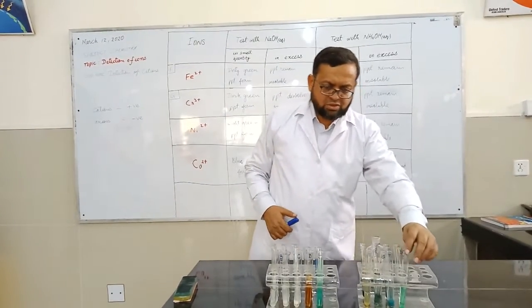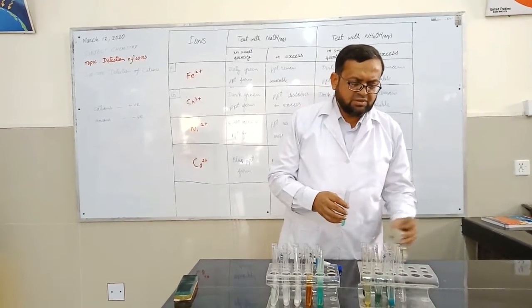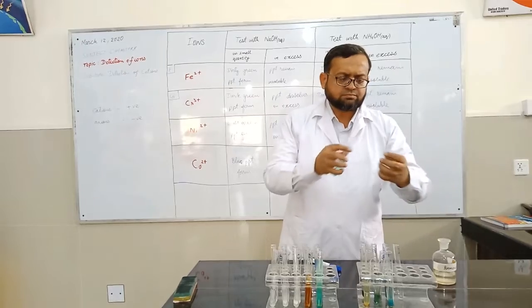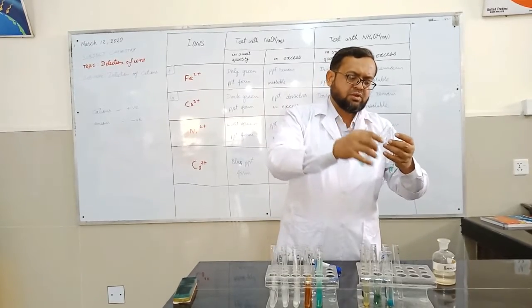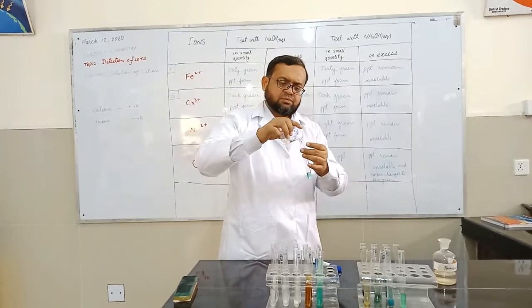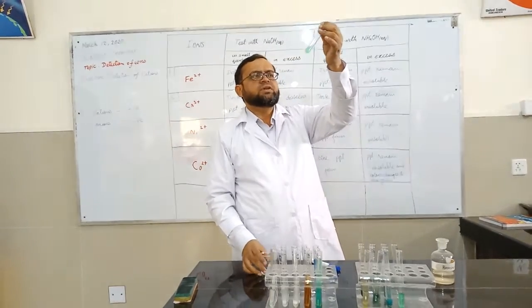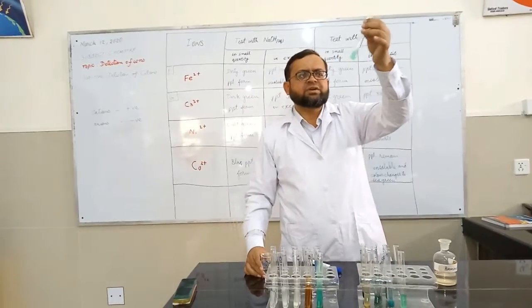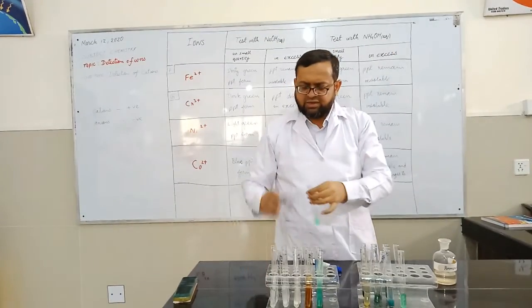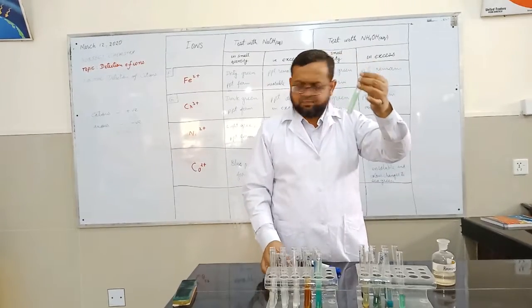Now come to sample I. Again we will perform the same test here. Very light green precipitates are formed, and even in excess the precipitate remains insoluble.